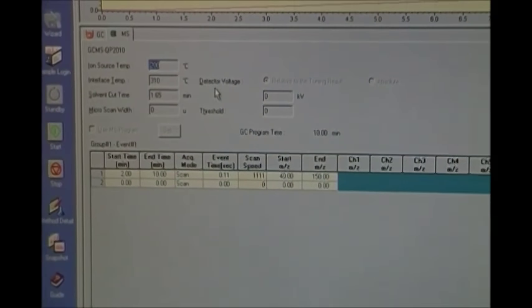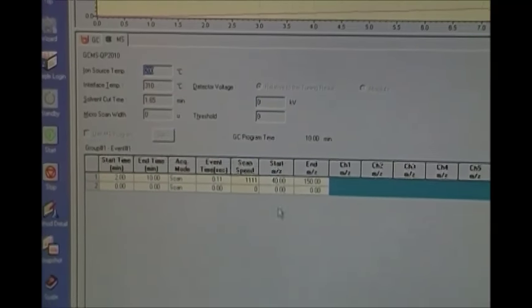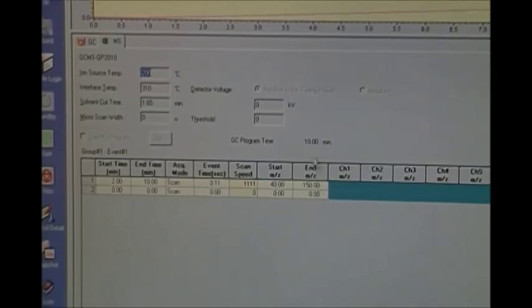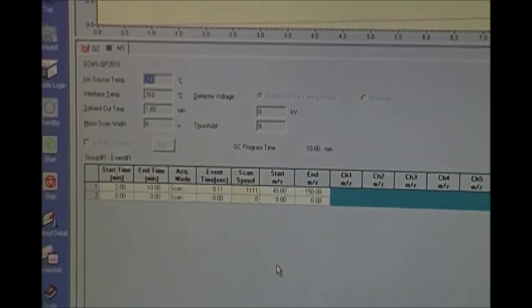So mass spec start. Okay, so basically this is the starting mass that we're going to look for. And then this is our end mass. So we're going to be looking between this range here of mass to charge ratio.